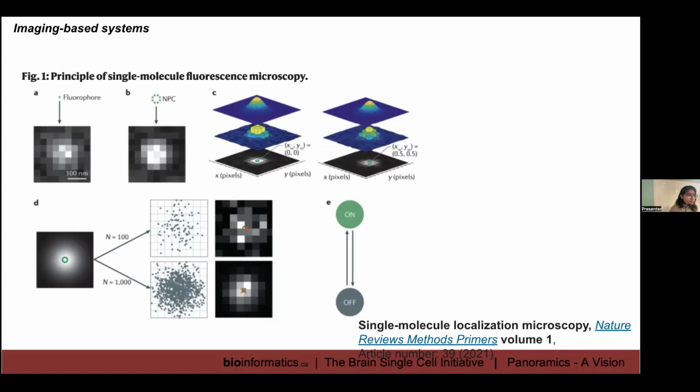They use some sort of prediction probability distribution tools to make sure that they can discern between 2 points that are so close to each other. They might even be in the same pixel, and they can identify which molecules these actually belong to.